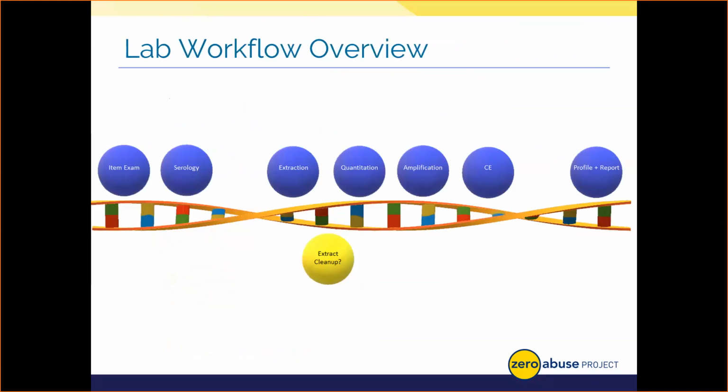So again, in conclusion, the slide before you just shows the process and each process along the way. Once your items are brought to the lab and into our custody, we could speed up the process by batching samples or going to automation, as I mentioned. But I really hope you realize that even one sample can take days to process alone, and that a larger case with multiple items can require weeks or more before you get results.